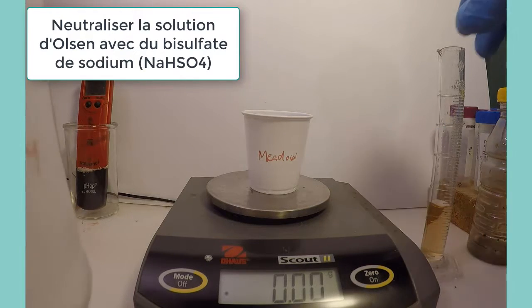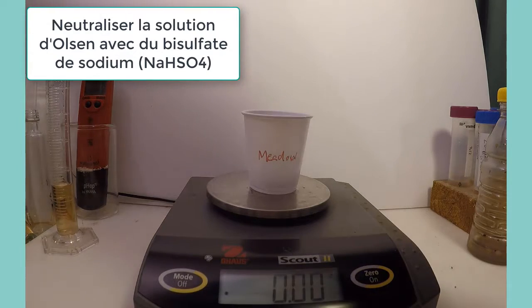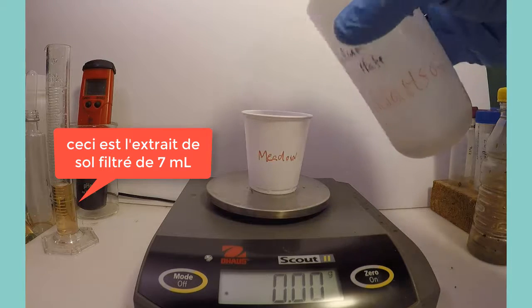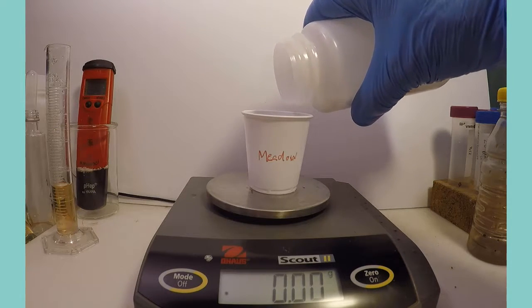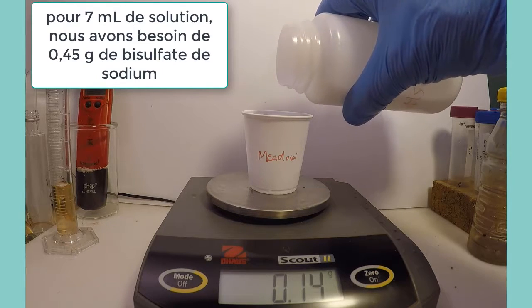The next step is to use sodium bisulfate to bring the pH of the extracted solution from alkaline to neutral. This will release dissolved bicarbonate as bubbles and will also prepare the solution for reacting with the phosphorus reagent package, which needs a low pH to create a blue color.